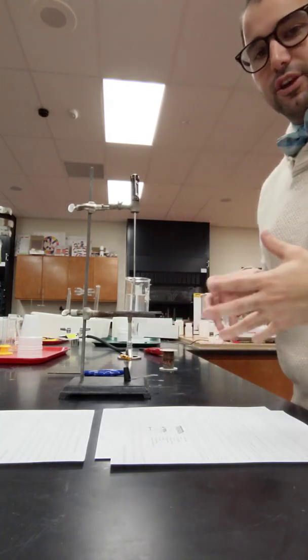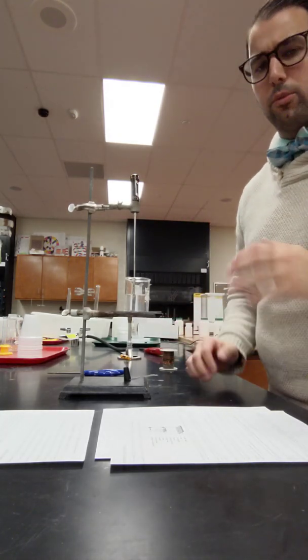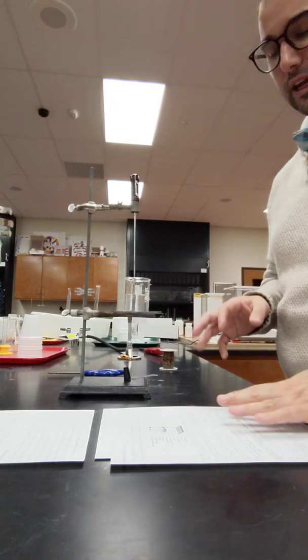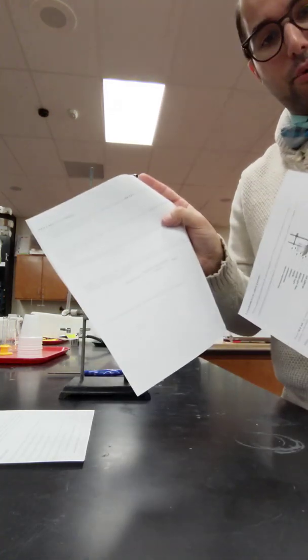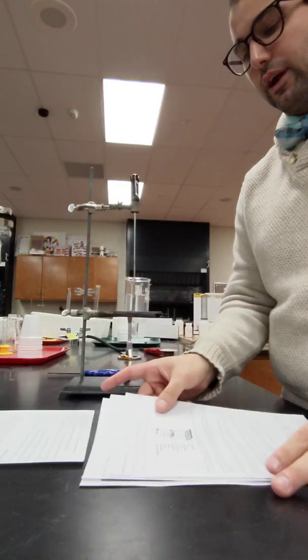All right, hey AP Chemistry. I wanted to just give you your quick setup for the Cheetos experiment. It's not going to be like a lab test that you're typing into. You're going to have a data table that you're just going to fill out and you're going to answer some post-lab calculations and that's going to be a separate grade.